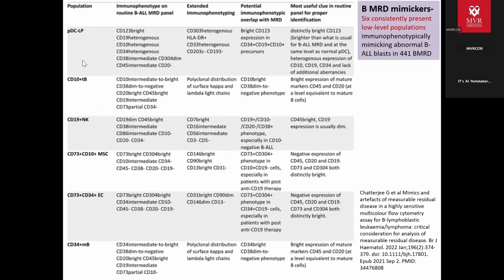If I come to the plot which is down, this is the lower plot. It is the same plot. The only thing is that I've put my gate down and included 5 lakh in my analysis. The same test, at the same time, but I'm not including the 64 lakhs in my subsequent analysis. I've just put the gate down and am analyzing my 5 lakh. Here I've put the gate down and am analyzing my 10 lakh.